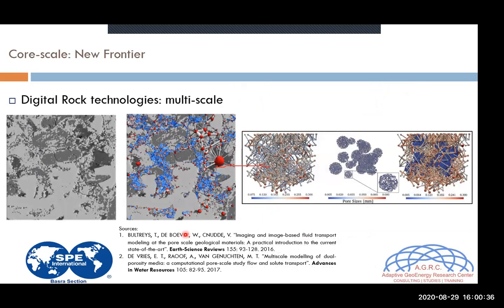It depends on the voxel size, the resolution that you are working at. So here, I'm just showing you an idea of, if you have, for example, an image, a model, and you perform the acquisition at a fine voxel size, you can reconstruct the pore system. Let's say the red and white pores and pore throats here. It's work from Bootface. It's really great. I encourage you to take a look at this as well.